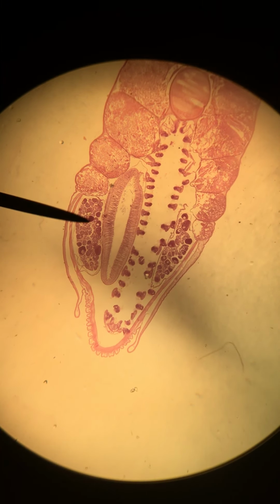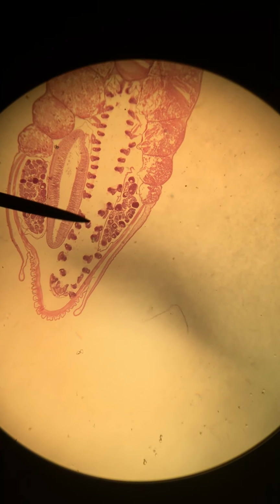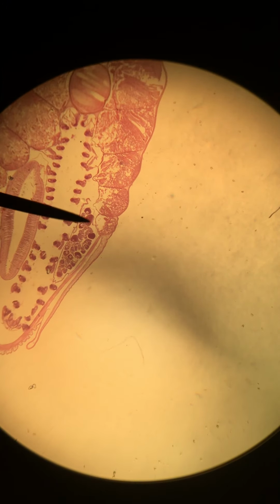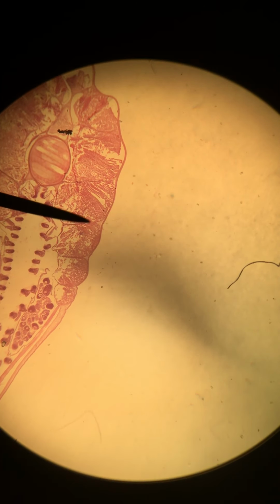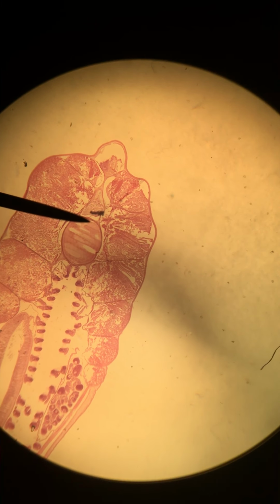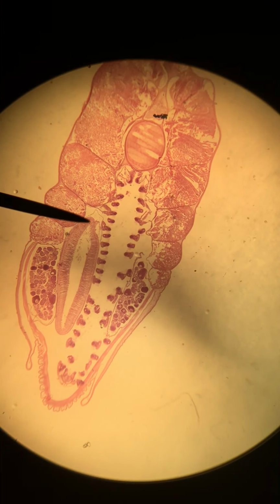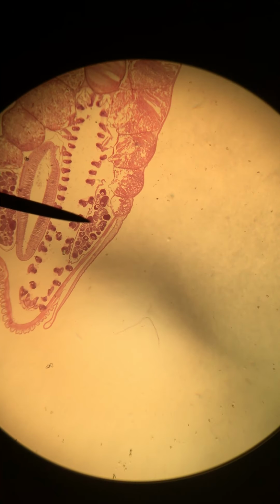We can tell this because if we examine them a little bit closer, we're going to be able to see eggs inside. So I'm going to zoom in just a minute to show you those in more detail. But first I'll just point out we still have our myomeres, myosepta. We've got our nice round notochord, dorsal nerve cord still here, dorsal fin still present here on the dorsal side. All right, so let's zoom in and take a look at our ovaries.